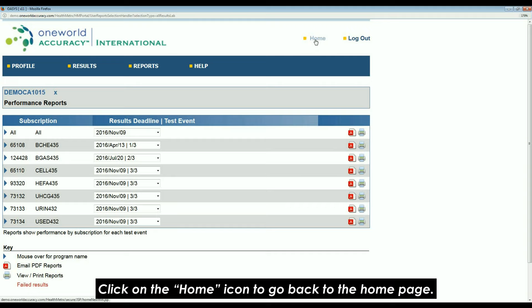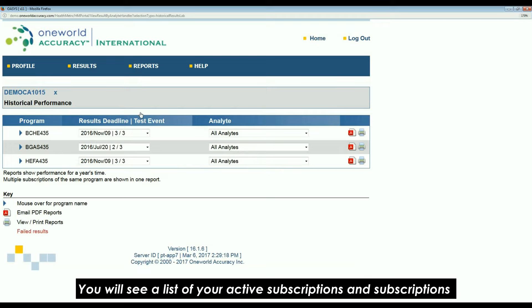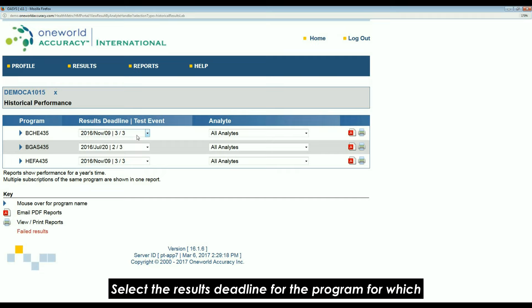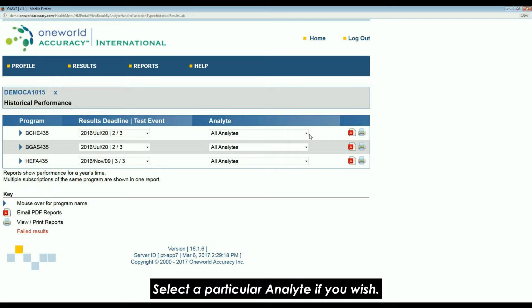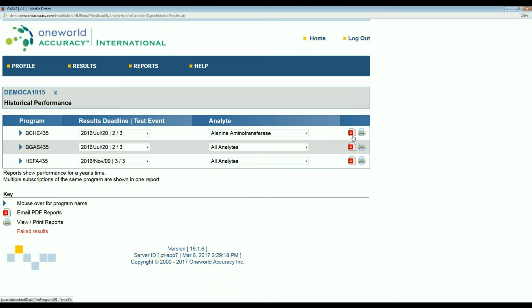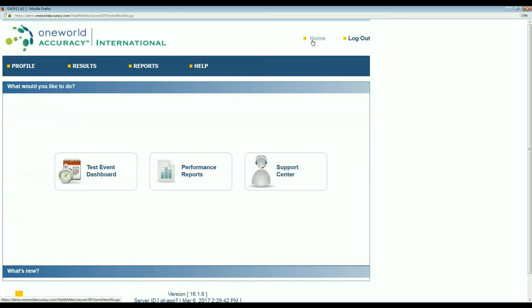Now, go to the third option, historical performance. You will see a list of your active subscriptions and subscriptions that have been cancelled within the past two years. Select the results deadline for the program for which you want to see the report. Select a particular analyte if you wish. Click on the printer icon to view the report or on the PDF icon to email it to yourself. Click on the home icon to go back to the home page.